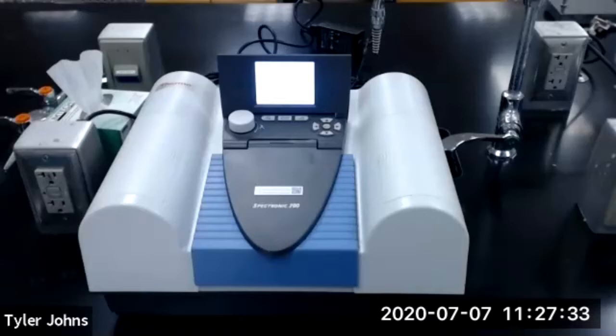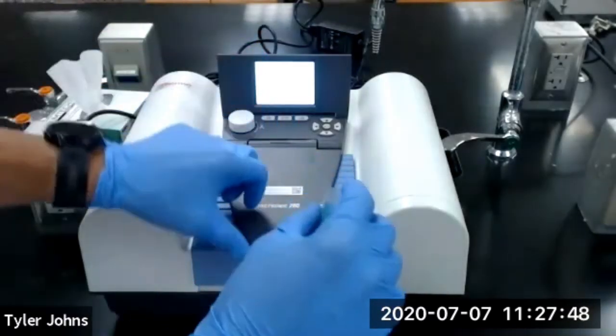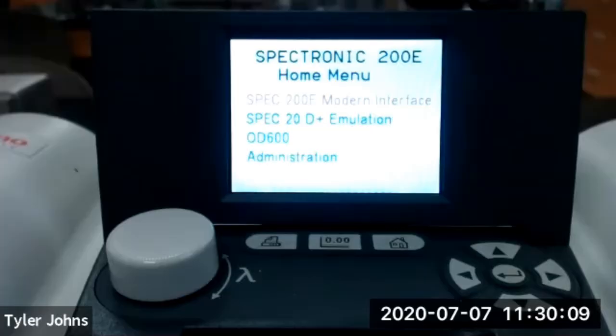We're next going to go over setup and operation of our spectrophotometer. So the first thing you need to do is turn it on and allow it to initialize. Upon initialization, we will then add one of our colored solutions in a cuvette to the spectrophotometer. After loading our cuvette with our colored solution into the spectrophotometer, we're now going to determine our analytical wavelength.